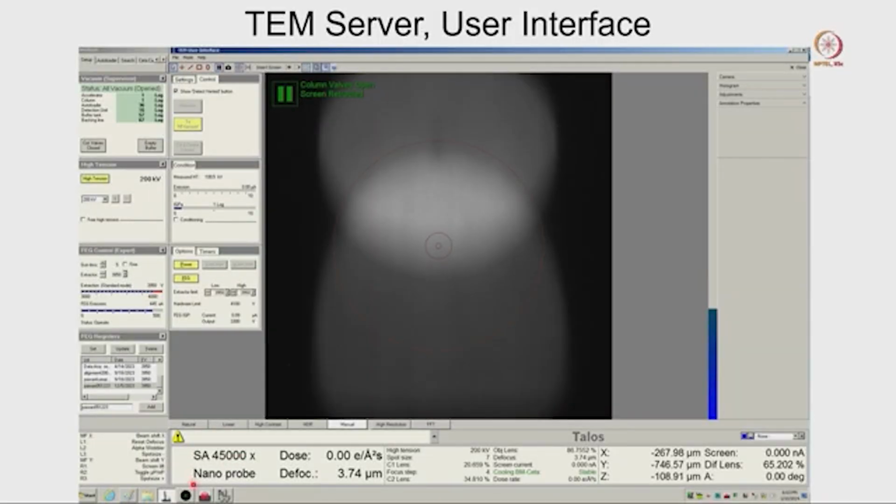If you look at this diagram here, you can see this is the magnification we are talking about, and this is a very important part, called the dose. When the electron dose goes through, you can see a very bright circular light here. I am going to show you those things, and in the workshop, those 6 classes, I will describe how this beam should look. The beam will be a circular beam and a very bright white beam.